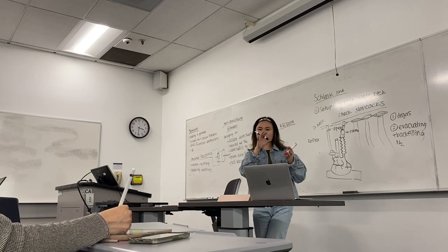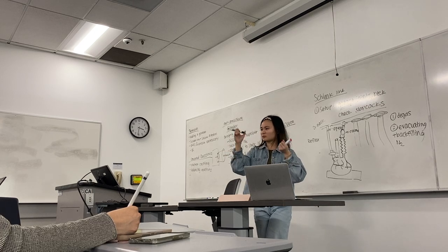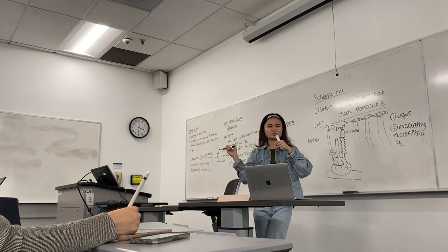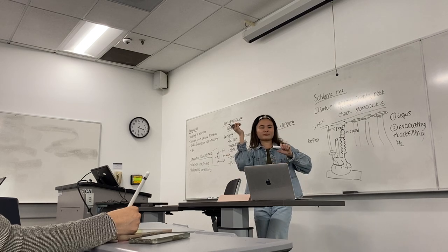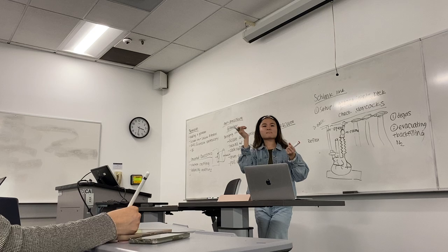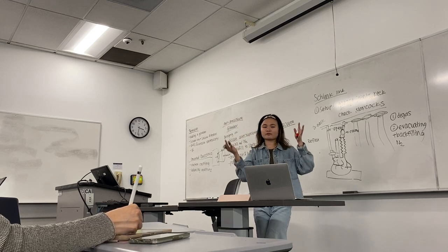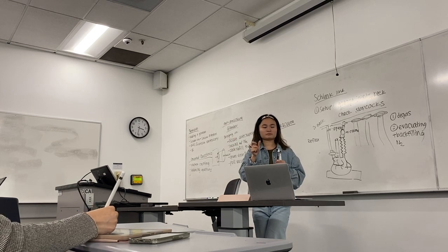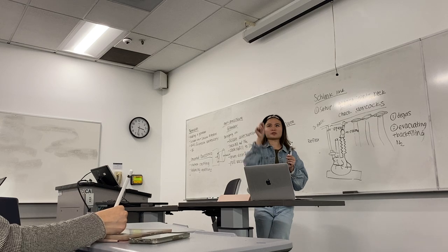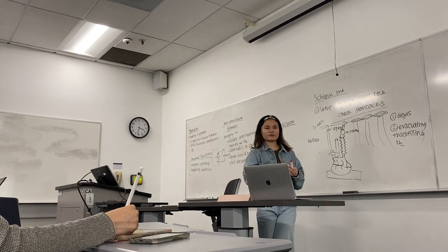To filter, does anyone remember what we put on the bottom when we filtered, when we inverted that? Was it nitrogen or vacuum? Vacuum to pull it through. So just understanding why we do those different parts. And for the upper one, it was static nitrogen, okay, because I don't think it would be as efficient if you had active nitrogen and active vacuum.